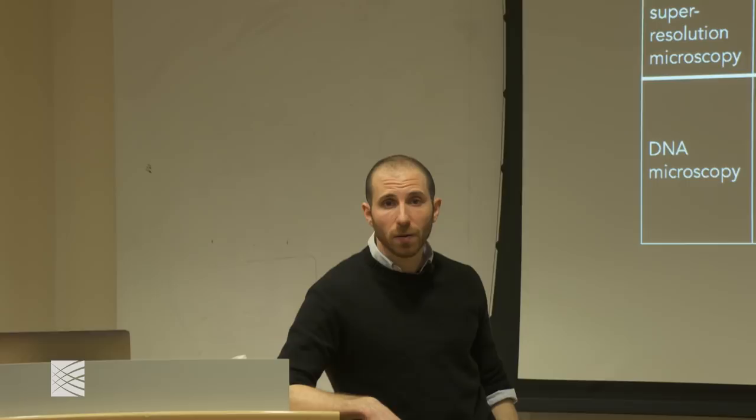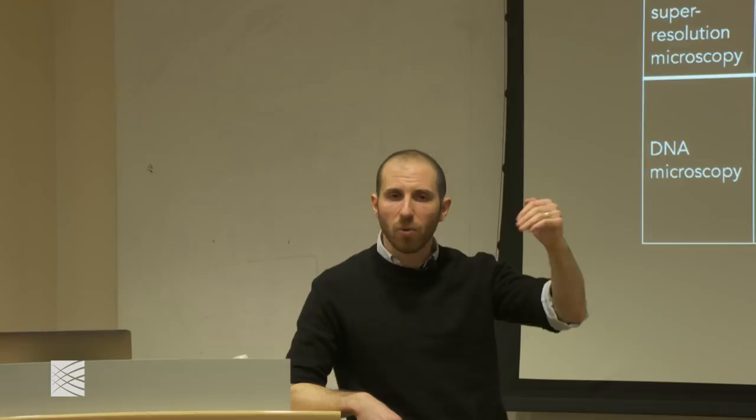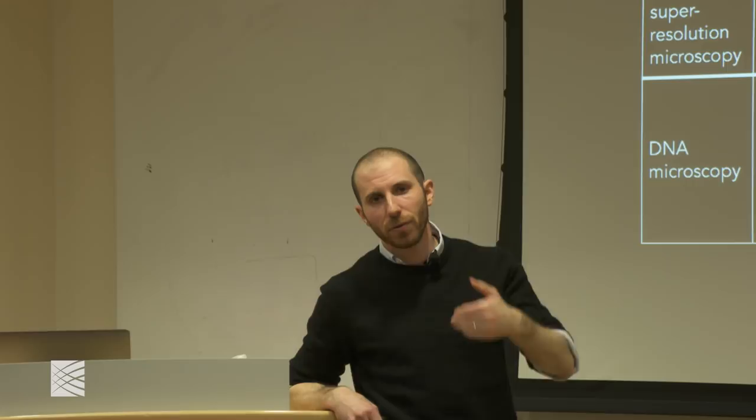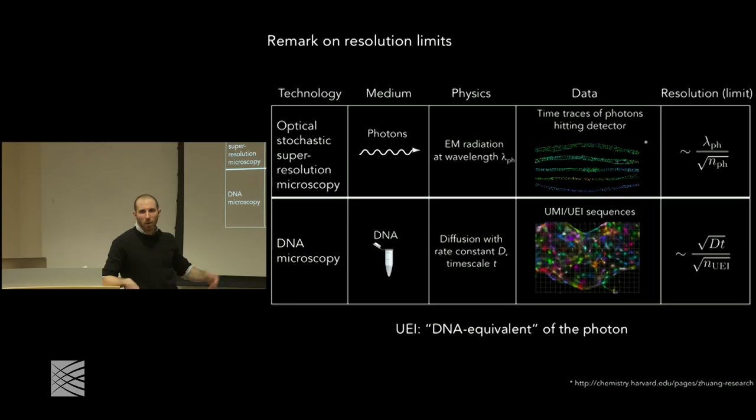But ultimately, there are other things to say about the way in which the number of cycles might create a deviation of the point spread function from a purely Gaussian approximation, which is again our model. The thing to keep in mind is that at every incremental step, what you're looking at is a superposition of Gaussians of increasing amplitude. Eventually, if you model this, the Gaussians with the highest amplitude will dominate over the Gaussians with the previous amplitude. And so you can mostly approximate it that way.